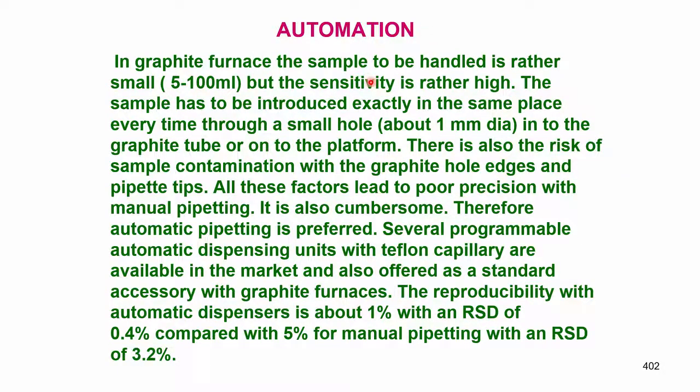And another concept in graphite furnace technology is automation. What is required is that in the graphite tube, the sample must be introduced through a micropipette.